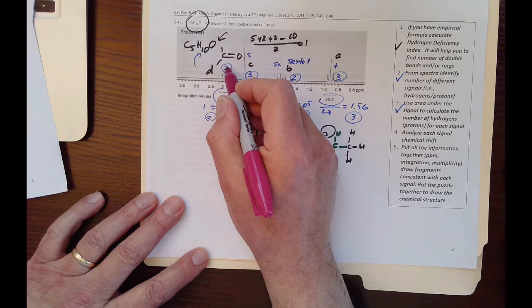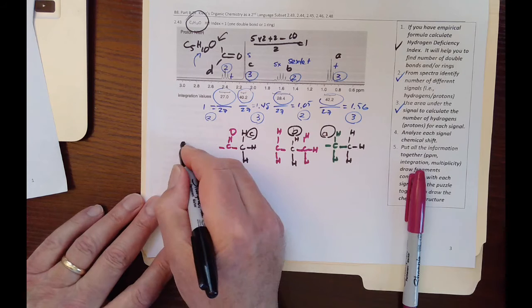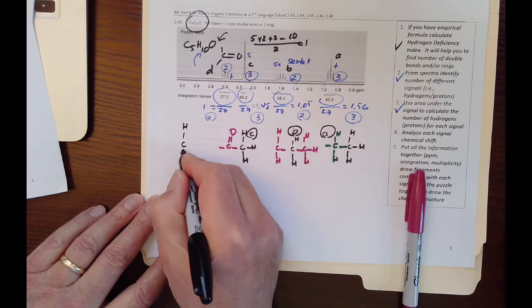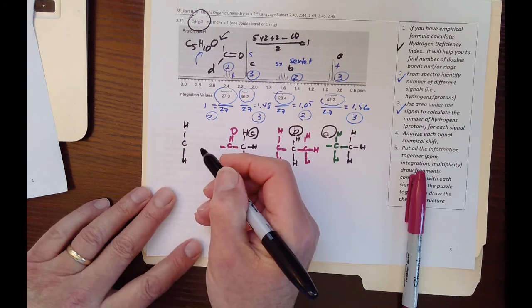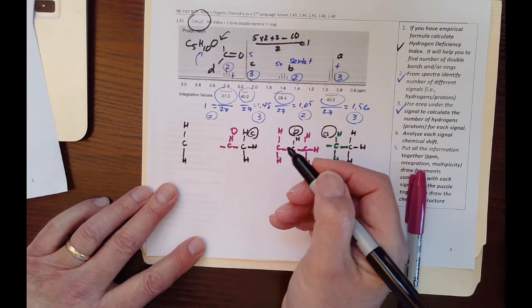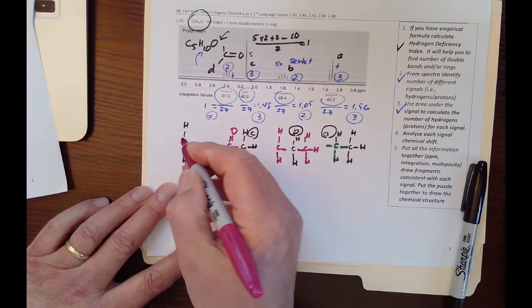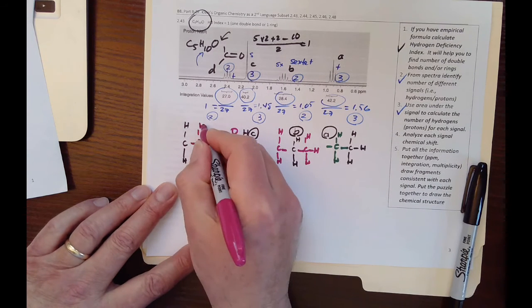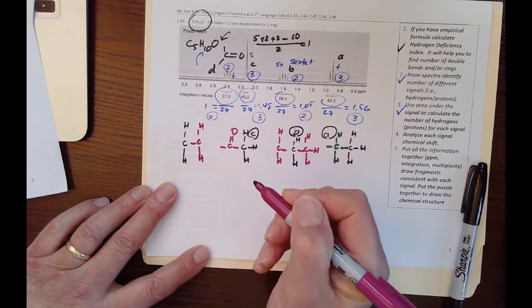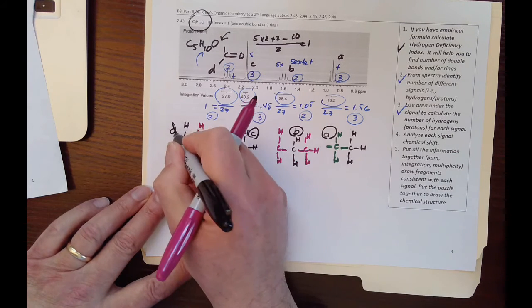Remember, we measured that, 2 hydrogen. So there are 2 hydrogen for D, and they are a triplet. That means it has only a CH2 next to it, so there are only 2 hydrogen next to it. So put the hydrogen here, or proton here. I call it hydrogen, but you should really call it proton. So this is my D.